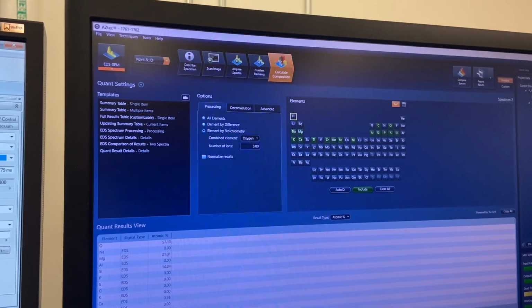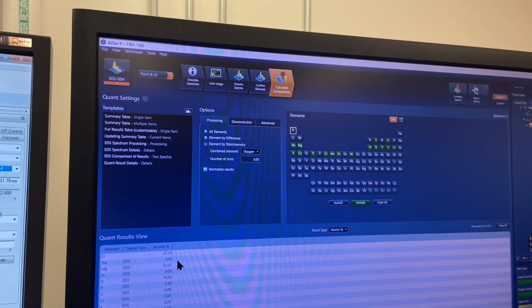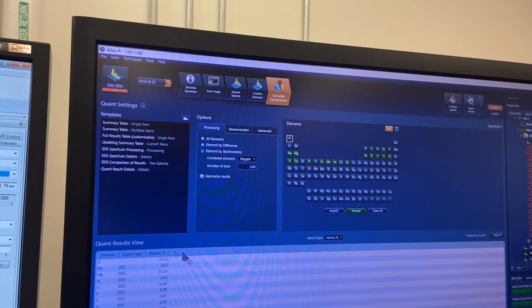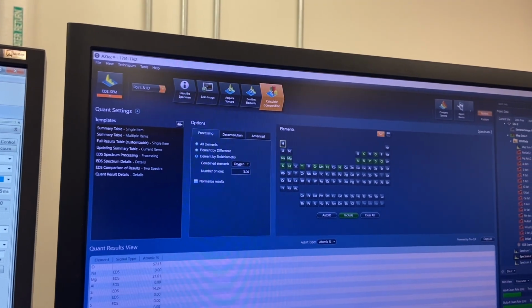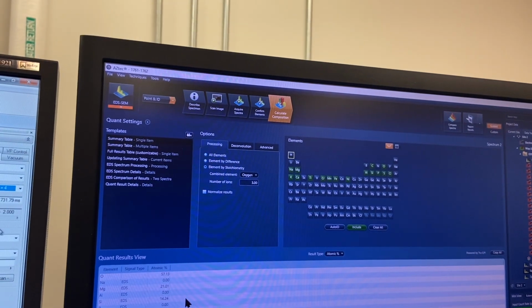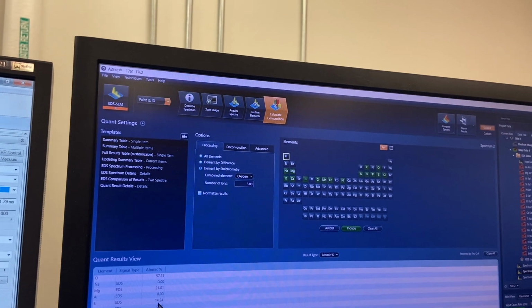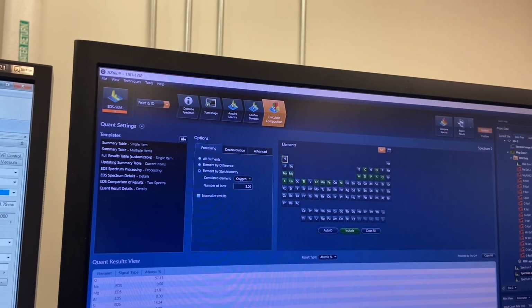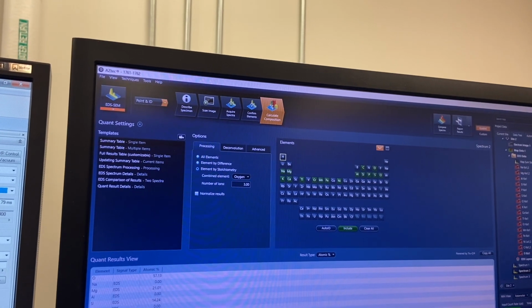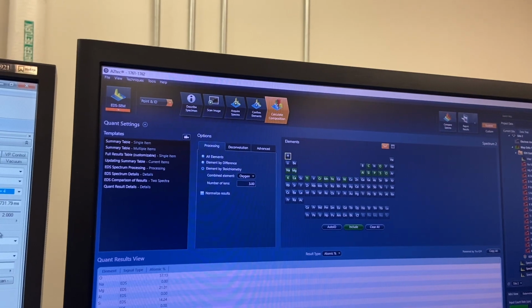Okay, it's 7 out of 28, so that's about 25 on the fayalite number. That's just iron, molar iron over iron plus magnesium. We use atomic percent for any sort of molar things. Atomic's always 100, because by default, it's the atomic makeup in moles or molar percentage. And let me see something right here. This divided by that, that's going to be a little above 73, so it's probably going to be more towards 78 or 80. So the iron manganese ratio is very distinctive.